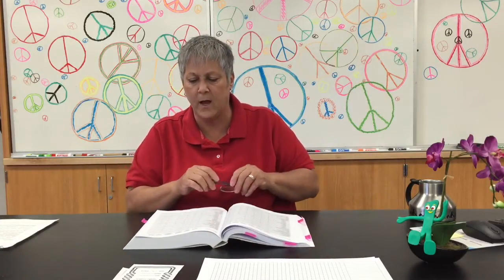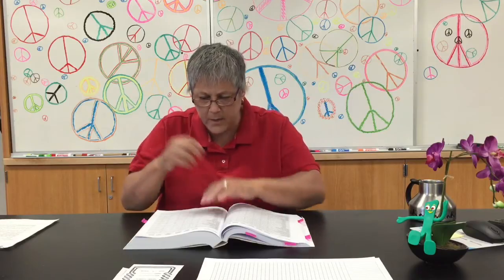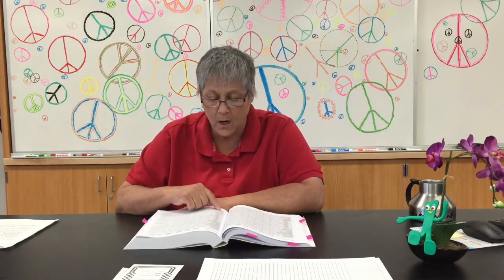I think I need the old glasses here. And here it is, Klebsiella pneumoniae, subspecies pneumoniae. The organisms' names are along the top of the table, and then the test names are along the axis on the left. And let me just kind of run through this, and you can be looking at your handout while I'm doing this. All right, so it says Klebsiella pneumoniae, subspecies pneumoniae.